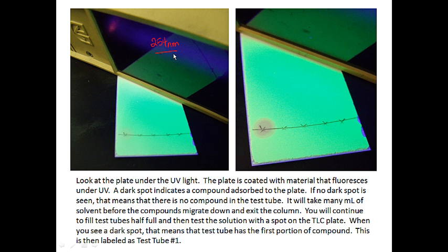wavelength. So as the UV light hits the TLC plate, that fluorescent coating will glow. If there is a spot on the TLC plate, as you see here, it'll appear dark. If you think there's a small dark spot here, there very well may be, but I'm looking for a fairly dark spot to indicate that that test tube actually had component in it. So you spot the TLC plate, and if you don't see any dark spot under the ultraviolet light, then that test tube doesn't have any component in it.